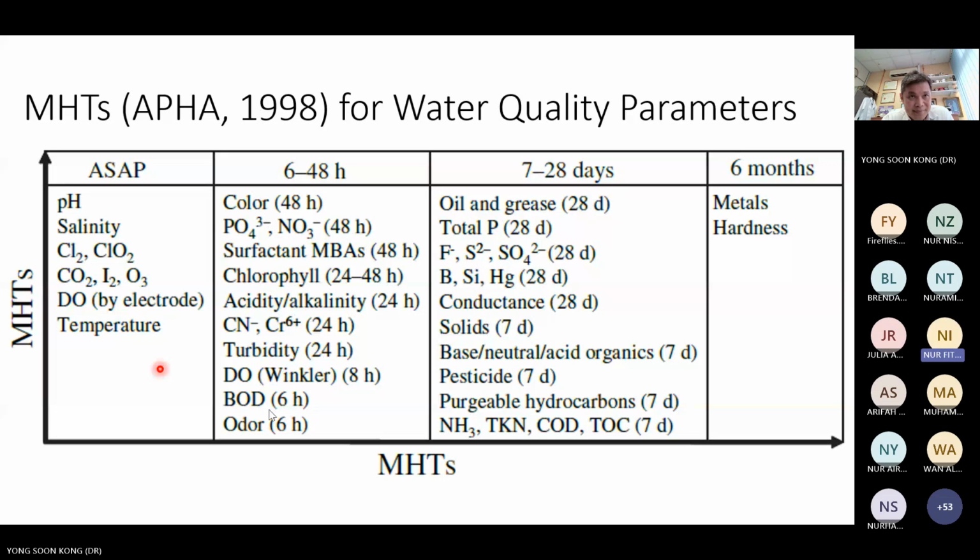So, is it COD, BOD, TSS, ammonia nitrogen, VSS, and is that all? Mostly are correct. I think you missed the pH and DO. Oh, okay, pH.